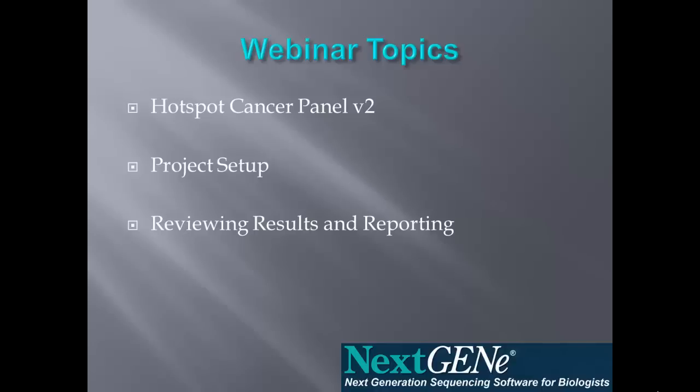In this webinar, we'll use sample data from the Hotspot Cancer Panel Version 2 to go through project setup, as well as reviewing results and reporting.